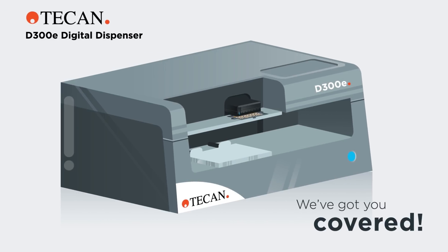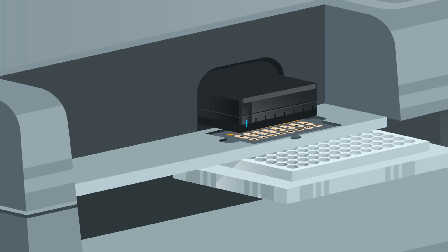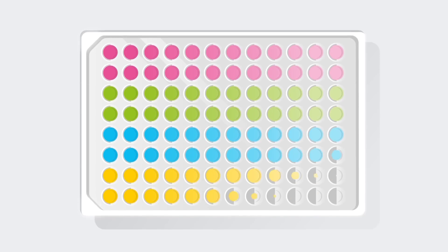Introducing the Tecan D300E Digital Dispenser, the solution to end your struggle. It eliminates the need for serial dilutions by dispensing picoliter to microliter volumes right from your stock, in seconds.